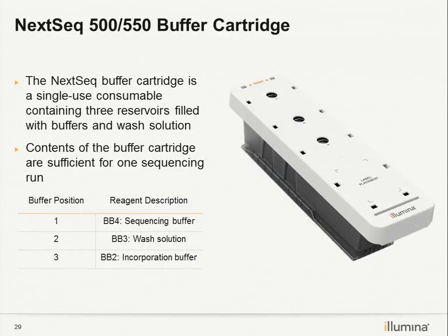And for the reagent buffer, it actually has 3 wells. Number one is the sequencing buffer, and then we have the wash buffer here, and the incorporation buffer. They are all preloaded, so there's nothing to add here.